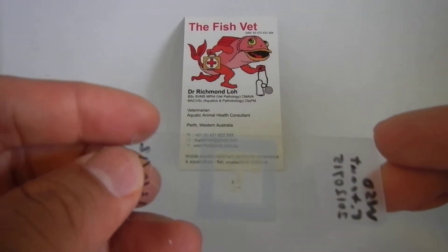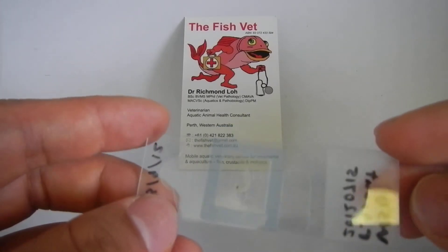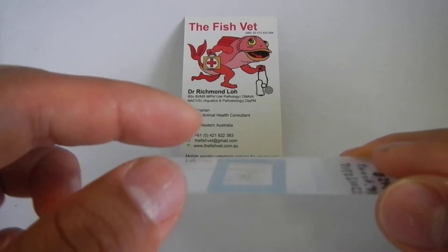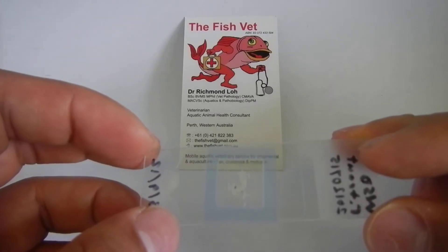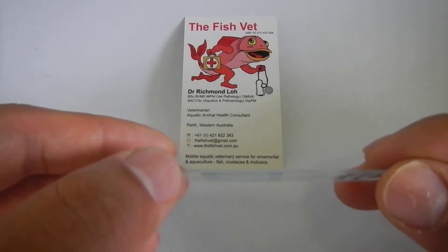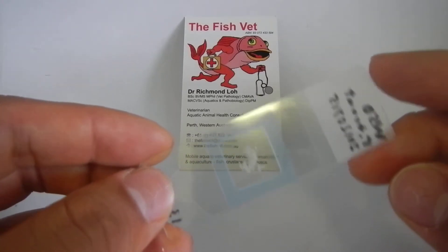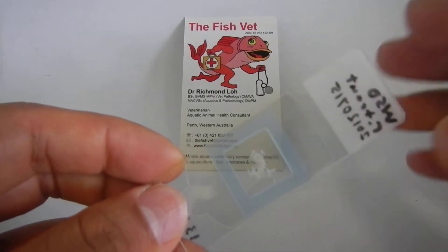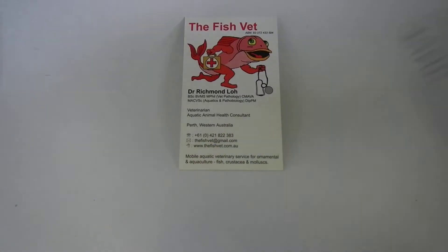I'd just like to show you this frame seal slide, which is really useful for preserving wet specimens for teaching purposes. Here we've got a gill biopsy with white spot disease encased within a frame, and this would as closely as possible simulate what students might see under a wet preparation. The bugs wouldn't be alive so they wouldn't be moving, but you get a good idea of the three-dimensional shape of gills and what to look for. So how do you make it?